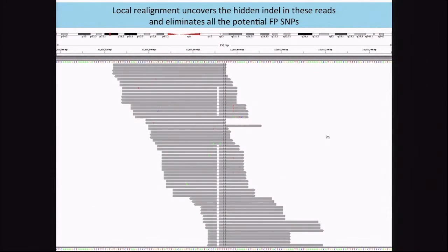If we pass that same data through the realigner, we find that the data is actually better explained through a deletion, and those clusters of SNPs have now disappeared.